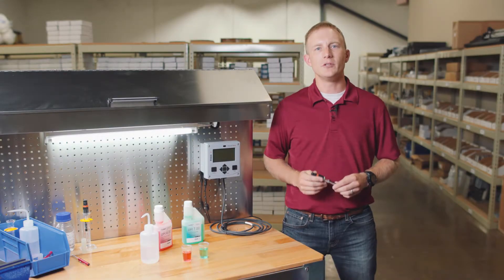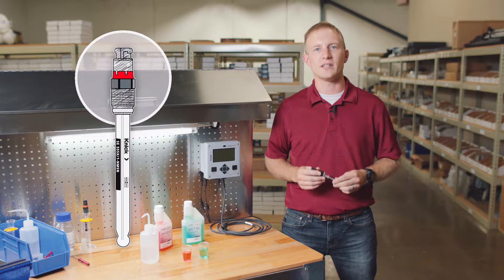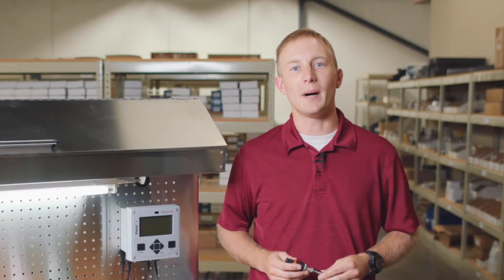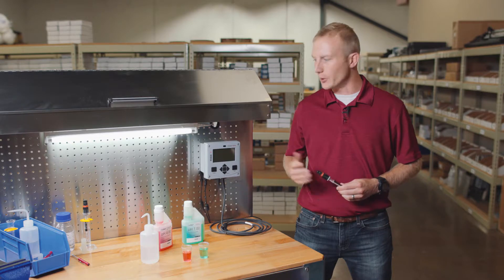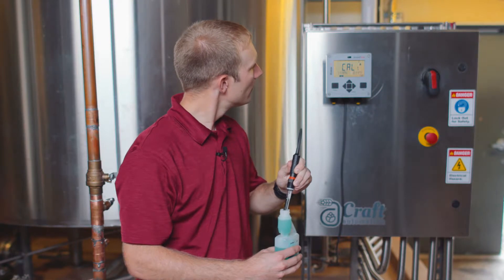The main benefit of using MemoSense digital sensors is that the calibration data is stored in the sensor head and not in the transmitter. This allows us to save time by pre-calibrating our sensors and storing them on the shelf. We can now perform our calibrations offline in a controlled environment right here in our workshop. These same steps, however, can be utilized when performing a calibration in the field.